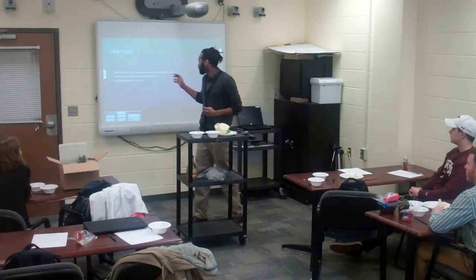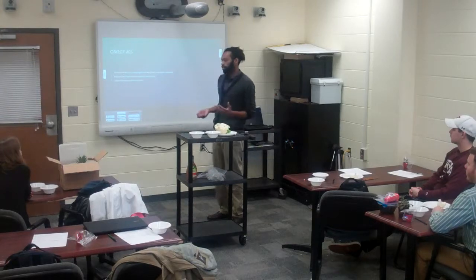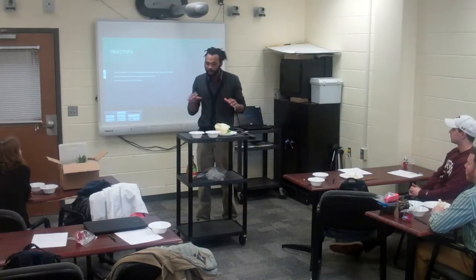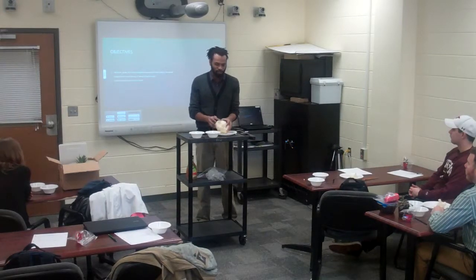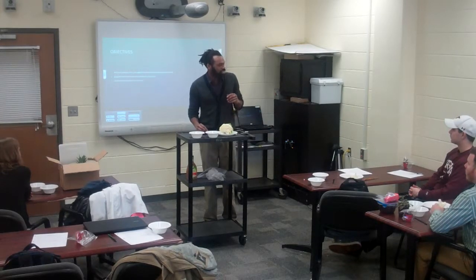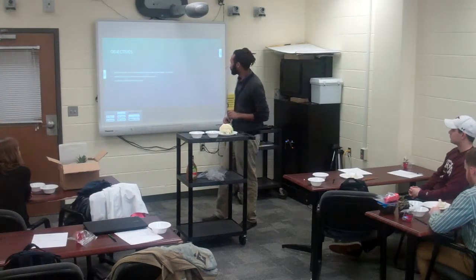These are my objectives. I'm going to address what micropropagation is, explain the steps, and explain some of the materials. Even though we don't have any of those for real, this is just a fun demonstration to get a feel for what micropropagation is and how it's done. But that's what today is.